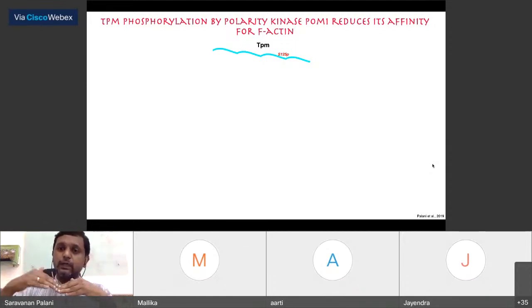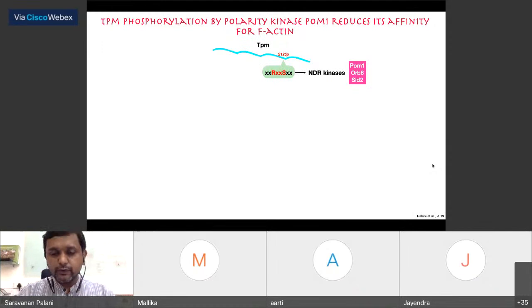So it will be exposed to the actin severing proteins or other proteins in order to come and act on them. So in this case also, we have to use a TIRF-based microscope. So here the problem comes, right? As I was telling in the beginning, many of the actomyosin or cytoskeletal proteins, tubulin, actin, tropomyosin, alpha-actinin, there are so many proteins you can name, you cannot tag them in the conventional way, either GFP in the C terminus or mNeonGreen or mCherry at the N terminus.